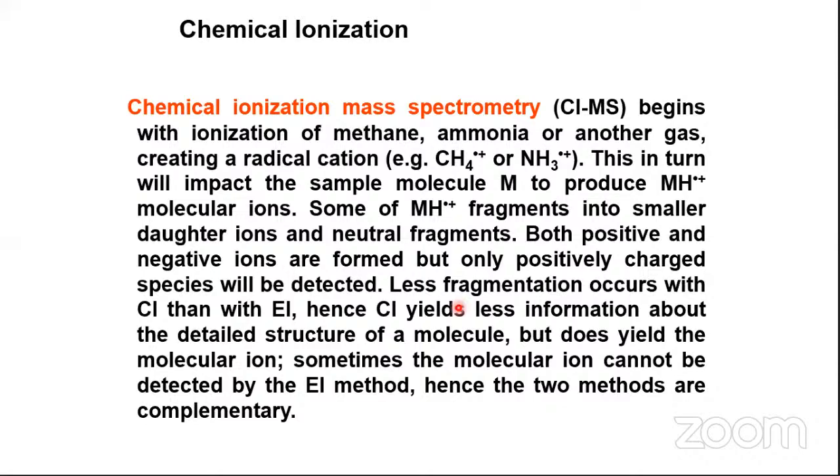compound. And if I'm working on a compound which is probably not in the libraries, that is, out of those 3 lakh compounds, then it is very difficult for me to judge from the EI spectrum that the highest molecular weight I'm seeing in the spectrum is the molecular ion. It may not be. If the structure is fragile, I may not get a molecular ion. So I need to confirm the molecular weight of this particular compound, because without the molecular weight I cannot really find out any information. Molecular weight is very essential.